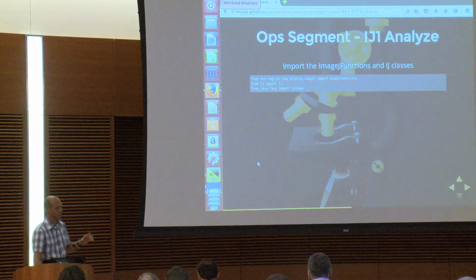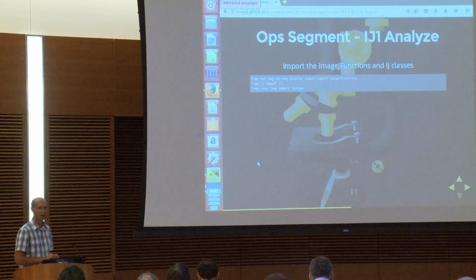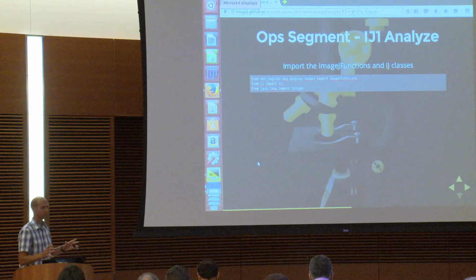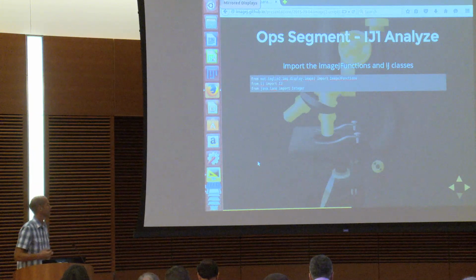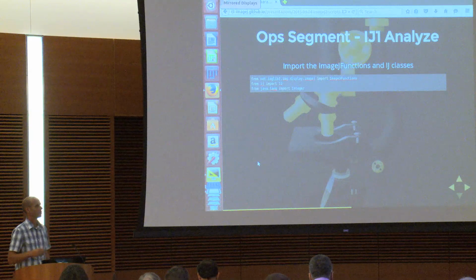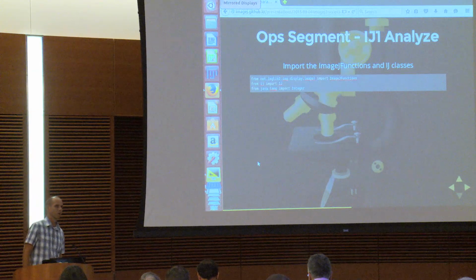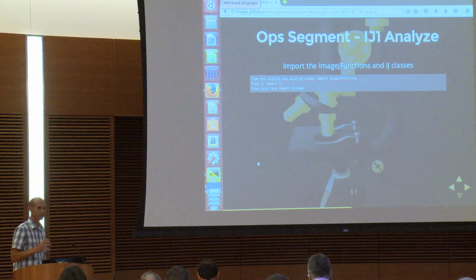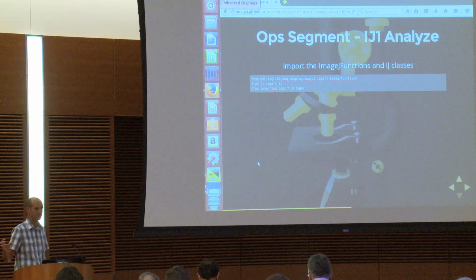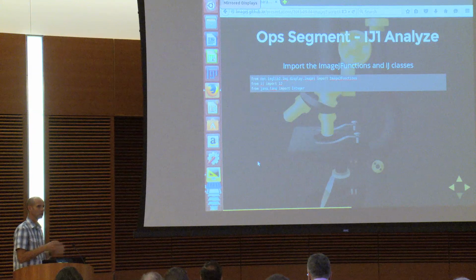Now, in this next step, we're importing some functions that we're going to need to translate between ImageJ2 and ImageJ1. One question that I often get from people, when doing tutorials like this, is, well, how do you know how to do this? I guess it goes back to what Curtis said about all the Javadoc and all the resources that are available. But it might not be intuitive. How would you ever know that you need this class called ImageJ functions to do these conversions?